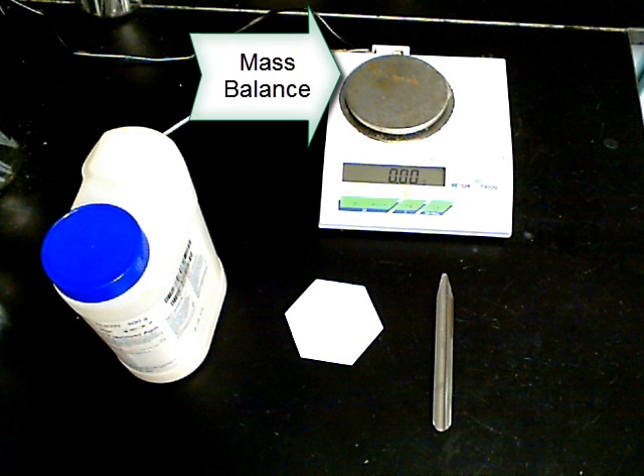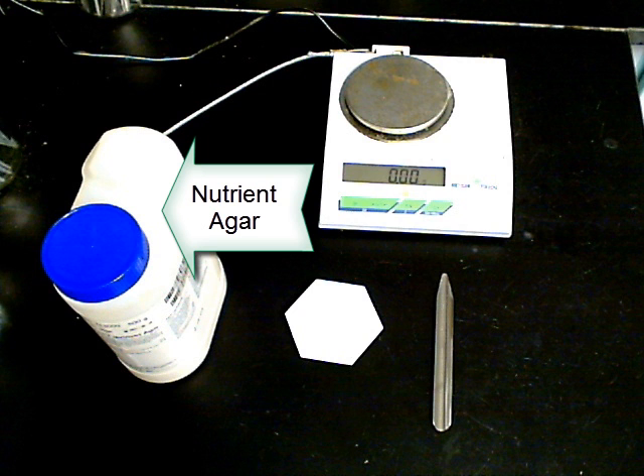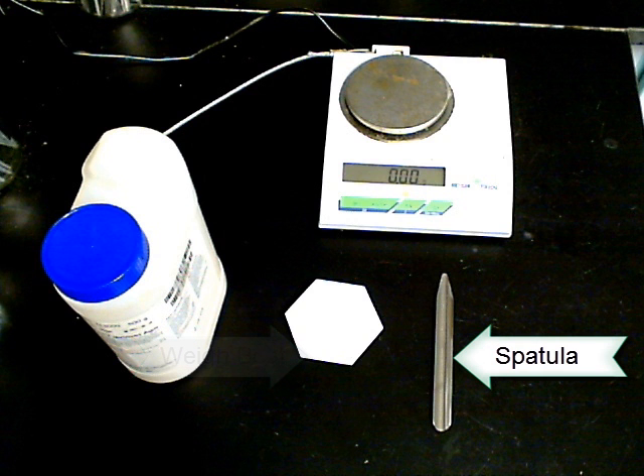The first step is to measure the correct amount of liquids or powders you will need to prepare the medium. In this example, since we are only using a prepared powder, we will need a mass balance, the nutrient agar powder, a weigh boat, and a spatula.